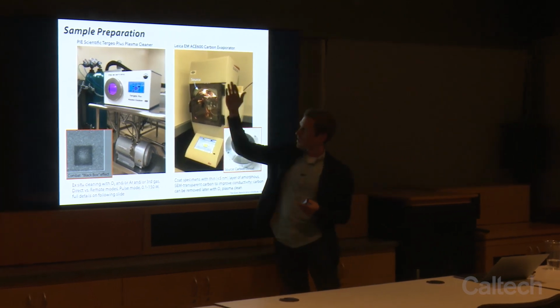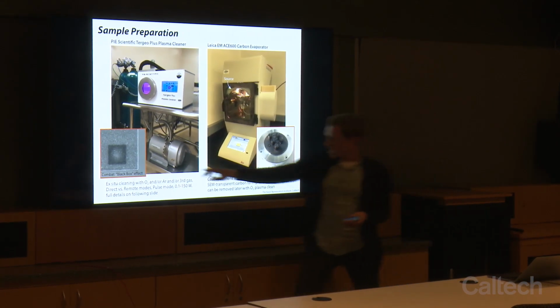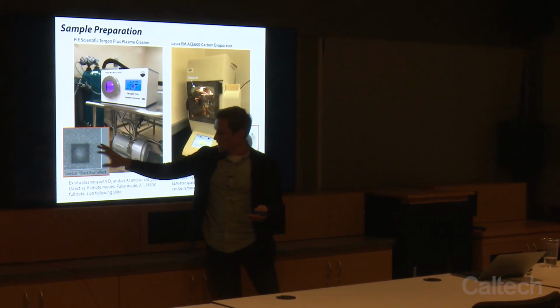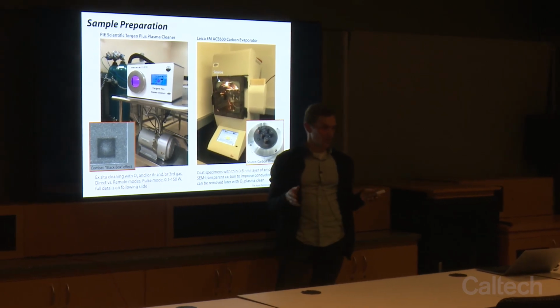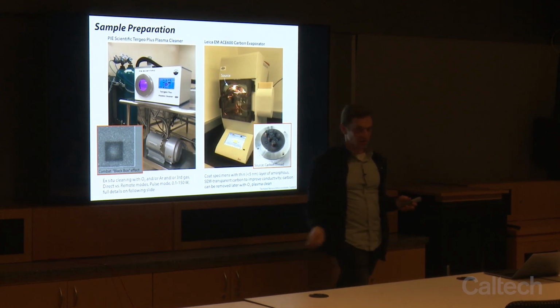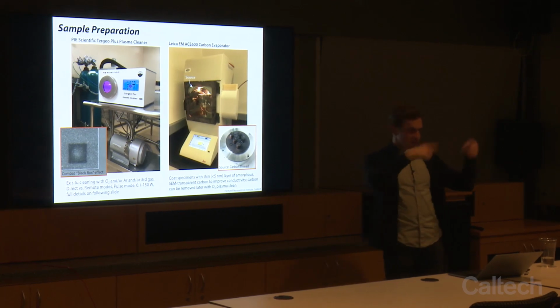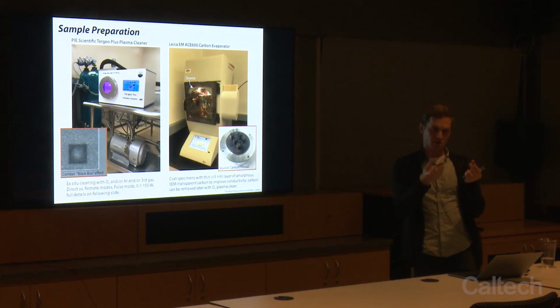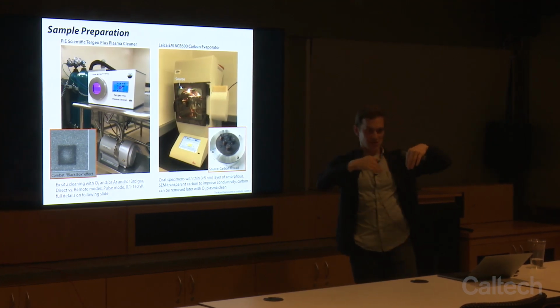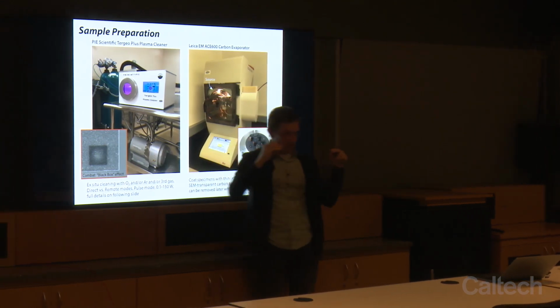Then we have an oxygen and argon plasma cleaner in the lab. So if you ever do SEM and you get these black boxes, then what's happening is if you have any carbonaceous material on your sample, then as the beam hits it, you're locally heating up that area, which evolves off these carbonaceous gases. And then because we have secondary electrons flying around, we actually can create a plasma locally, and we can get chemical vapor deposition of those carbonaceous species back down onto the surface of your sample, and now they're more like localized at the surface.